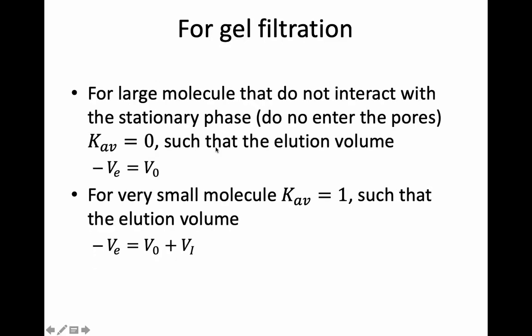For example, if a large molecule doesn't interact with your pores, your gel partition coefficient is 0, and you would expect it to be eluted as soon as you start collecting, at the same volume as your mobile phase.